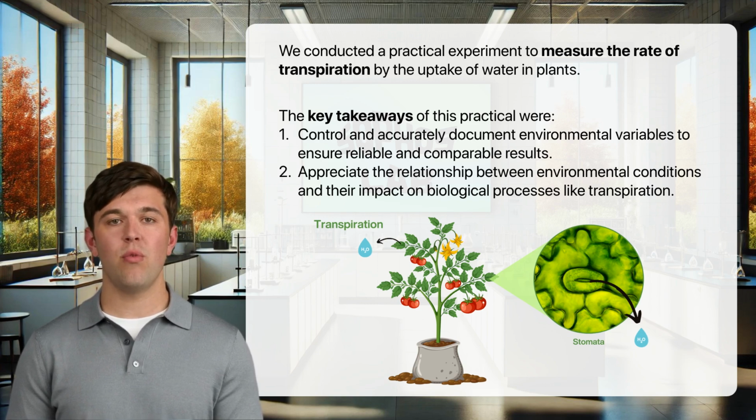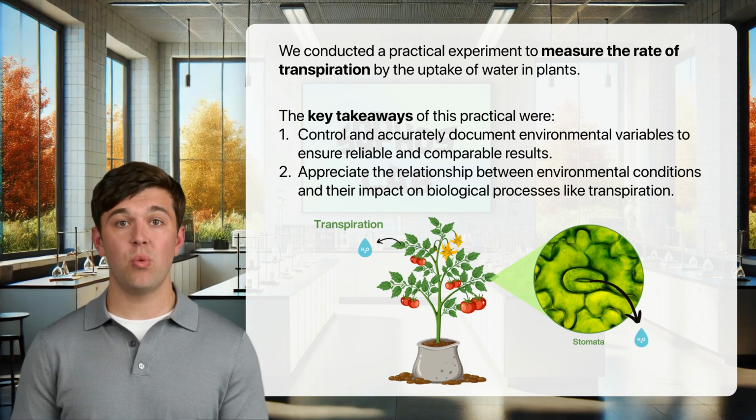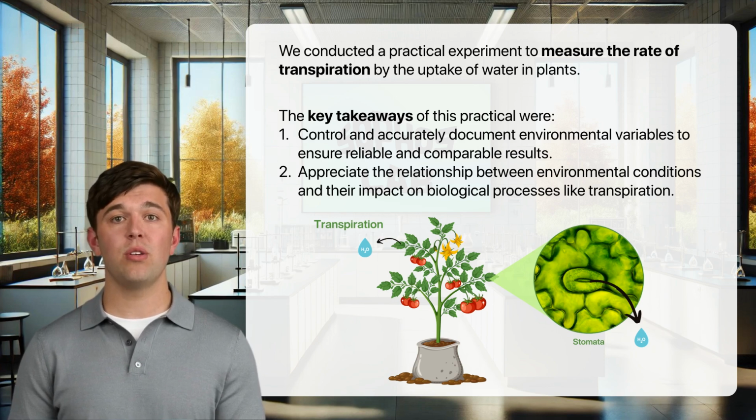This practical reinforces our understanding of how plants manage water loss and the importance of environmental factors in influencing transpiration rates. Additionally, it highlights the need for precision in setting up experiments to achieve accurate and meaningful results.